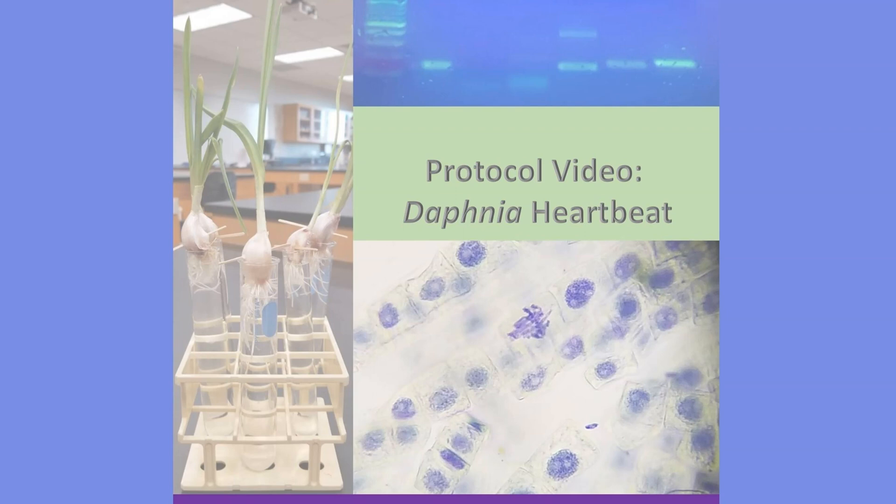In this video, you will learn how to visualize a Daphnia under the microscope and how to treat it with different solutions to test their effect on its heart rate.